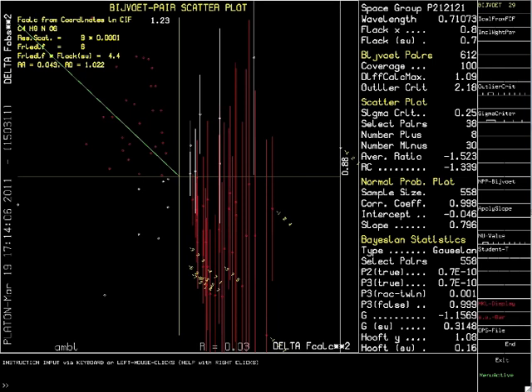For this structure of ammonium bitartrate, all indications are that the refined model is the wrong model, and that the structure should be inverted.